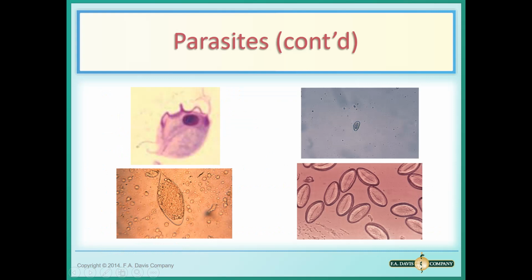There is our friend Trichomonas. This is Schistosoma, which is very oval shaped with inclusions in there, and you can see how that could typically be mistaken for a white blood cell, but look at the size differential. So maybe there's a white blood cell there, and look at the size differential. It's huge comparatively. Here's a pinworm egg, and this is one as well.